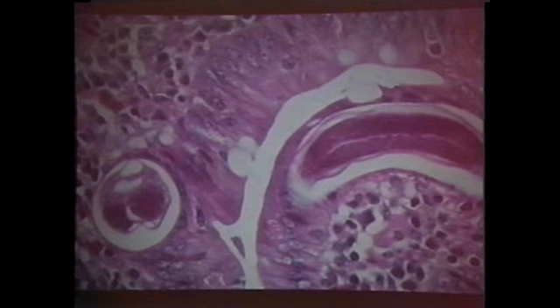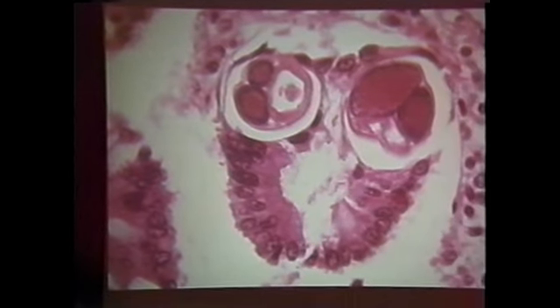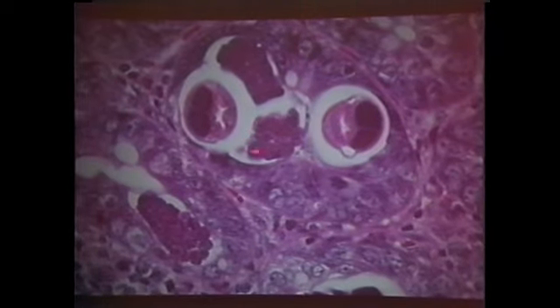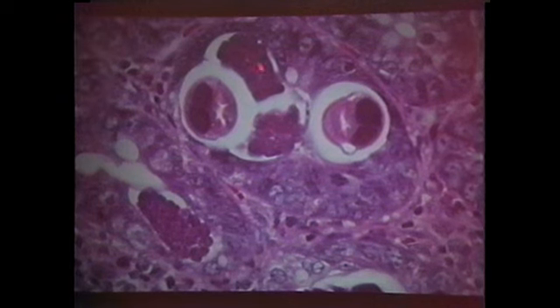Strongyloides. Almost all species of animals have Strongyloides. It's not only man and horses and chimps and stuff. But you can only find females. Notice there is an intestine and 2 genital tracts. You only find females in tissue sections. Here are your females, 2 genital. And they lay uninucleate to 3-4 cell stage morula, and these start to embryonate, and you later have larvae in the tissue. So look for larvae as well.